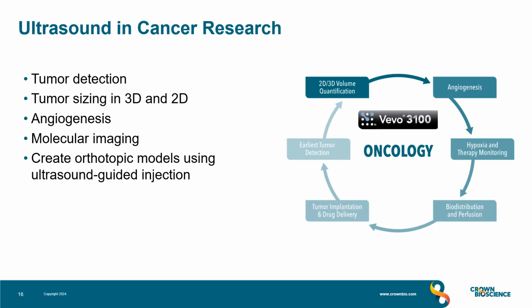So, for use in cancer research, ultrasound allows tumor detection. It allows tumor sizing in either 3D or 2D. It allows measurement of angiogenesis, molecular imaging, and you can create orthotopic models using ultrasound-guided injection.